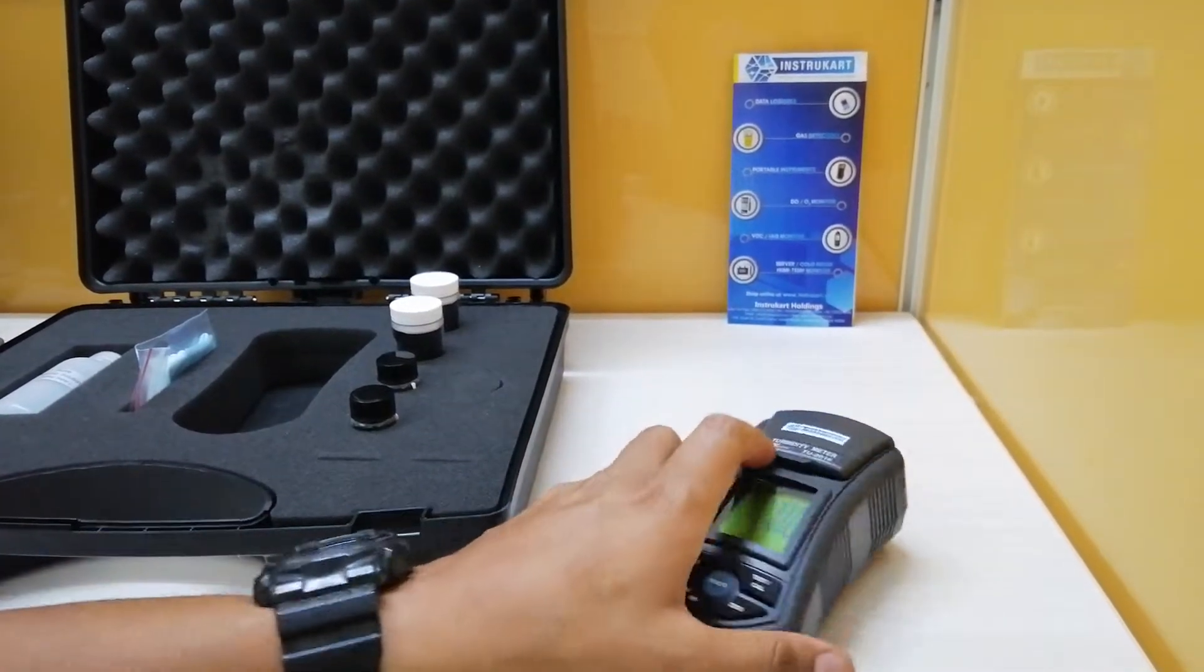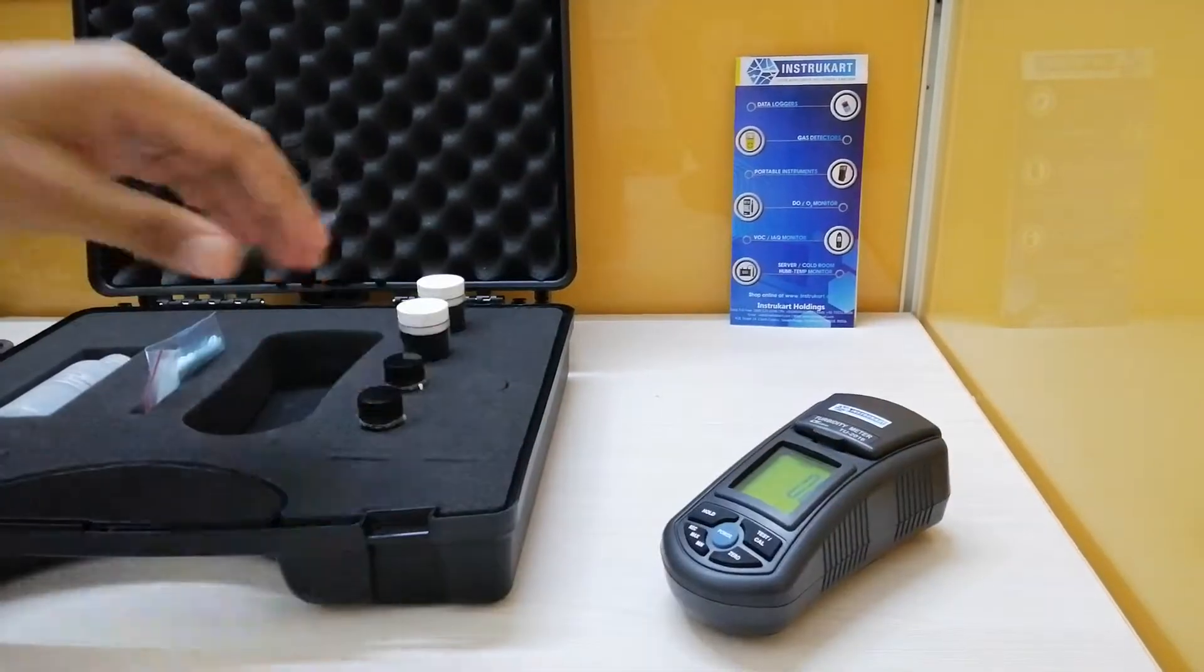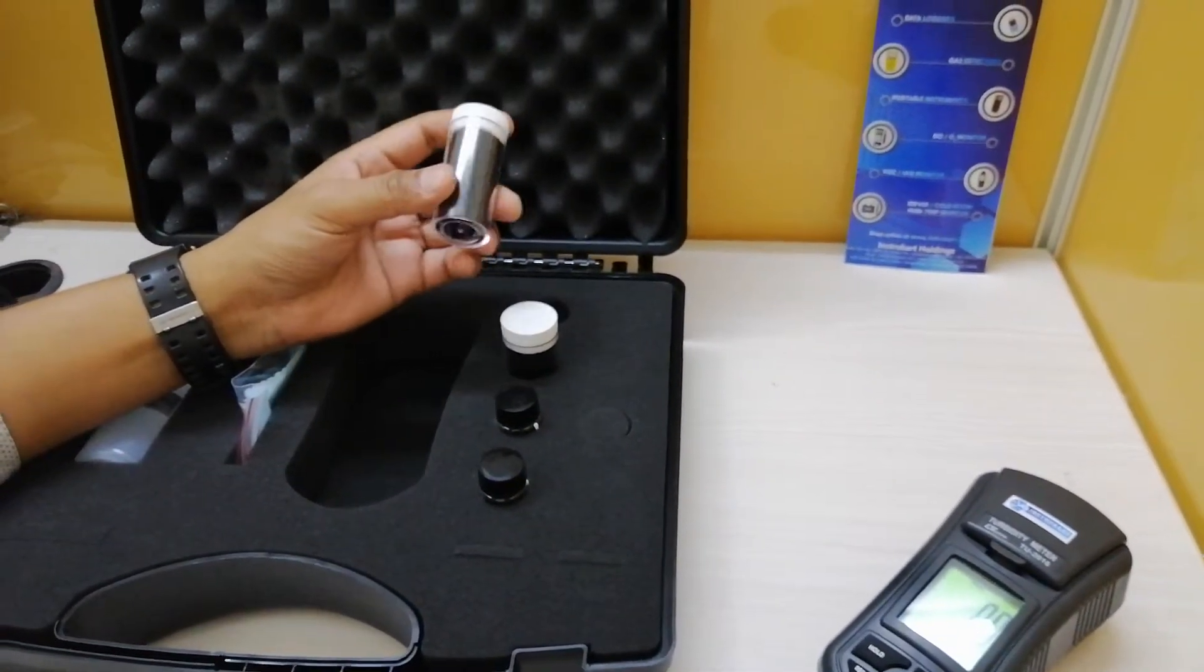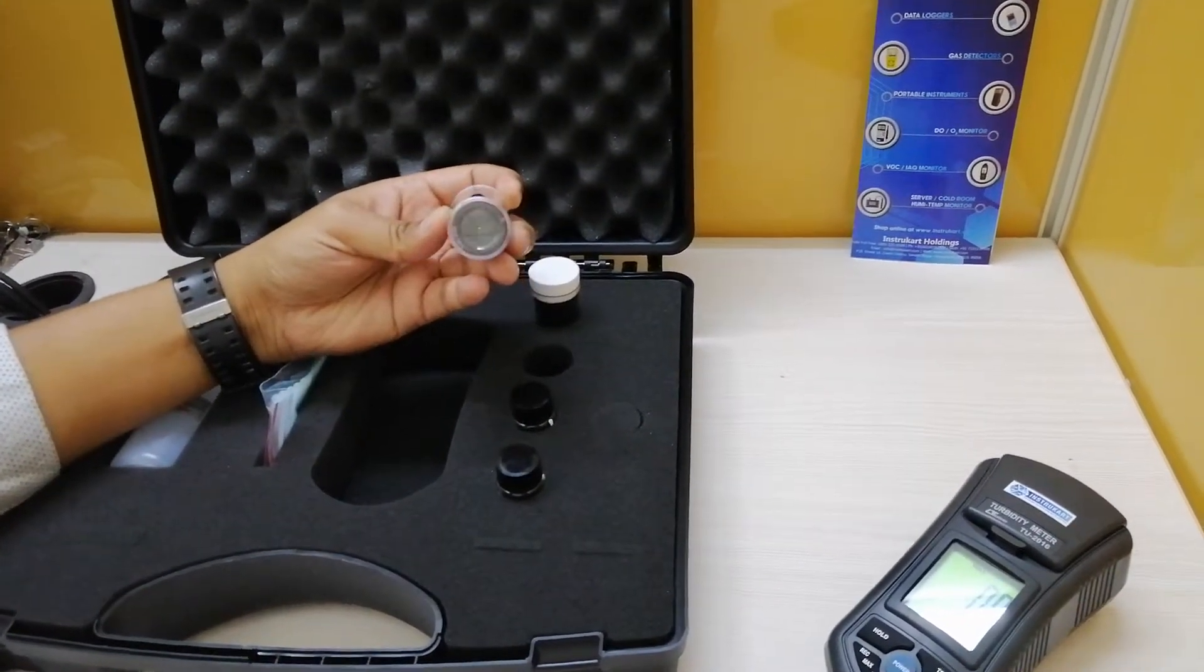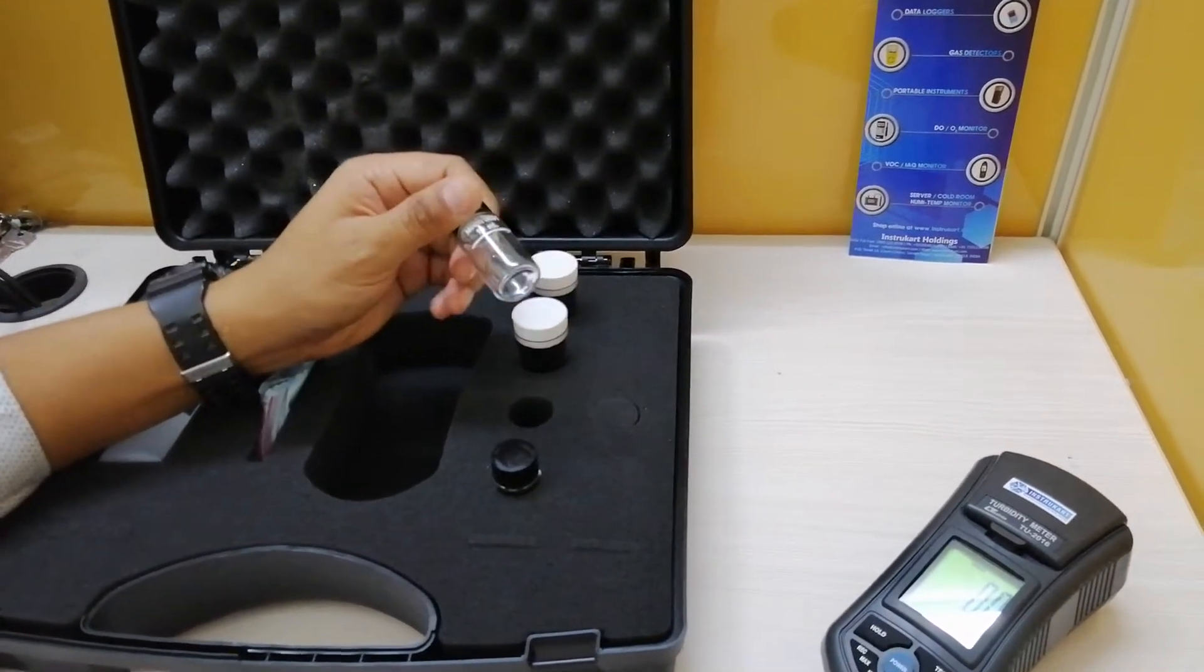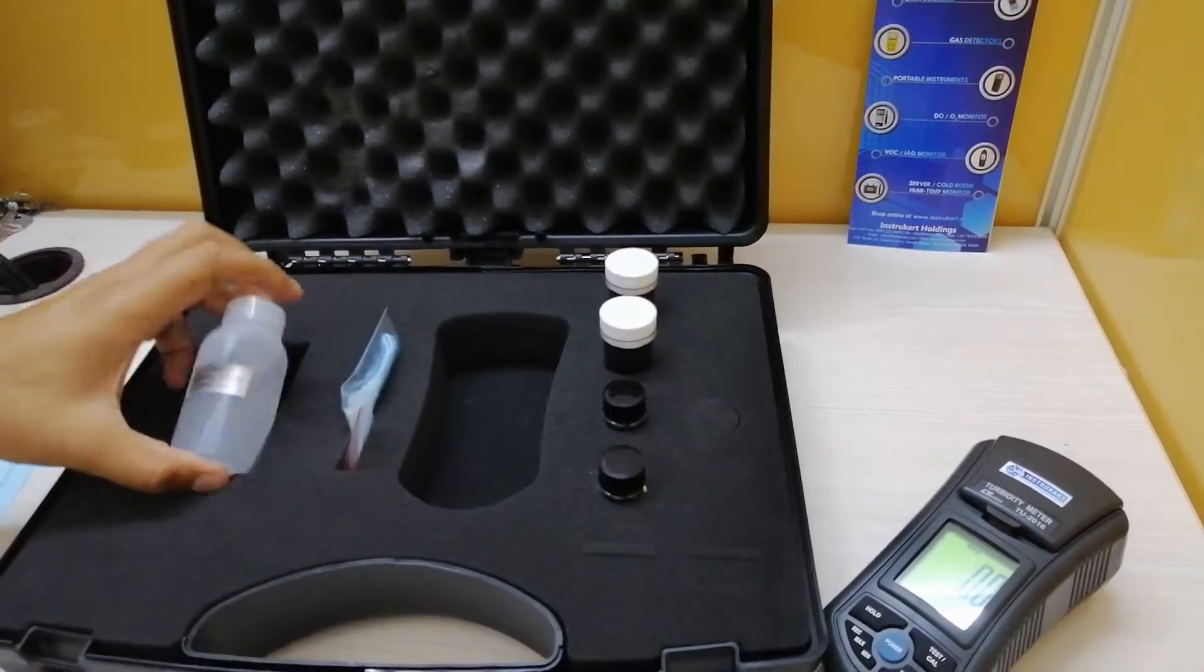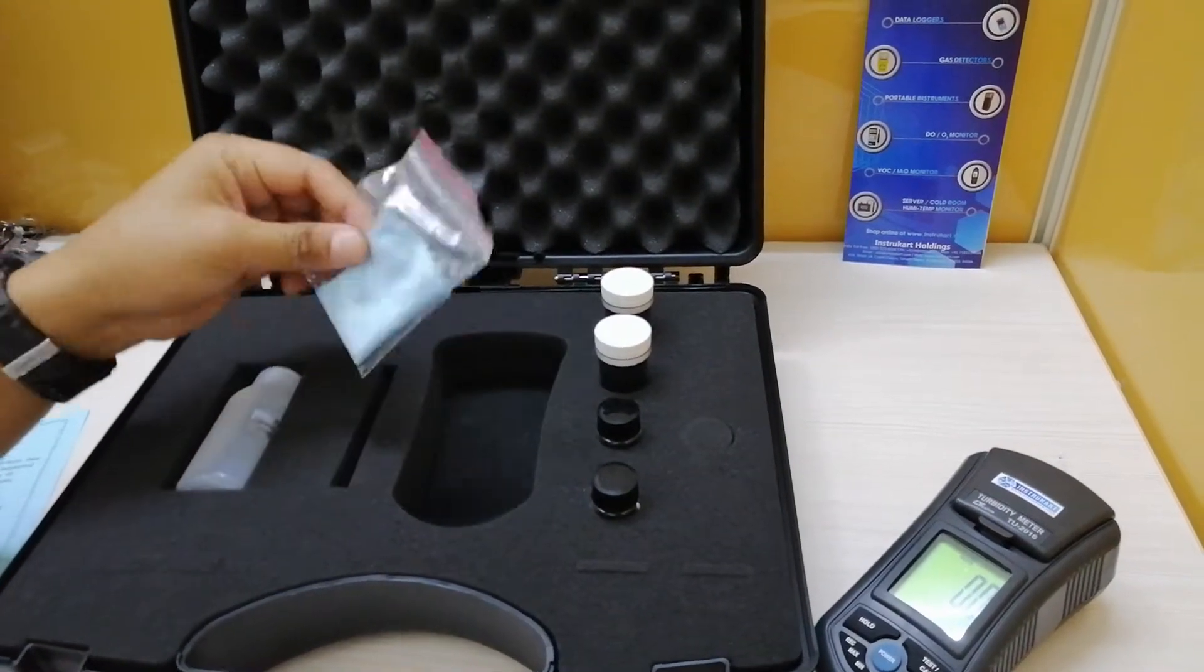The accessories which will be included with this particular thing is the instrument. This is the testing bottle with 0 NTU standard solution. Testing bottle with 100 NTU standard solution. This is the empty testing bottle, 10 ml. Another empty testing bottle. This is the cleaning solution, the distilled water, and the cleaning cloth.